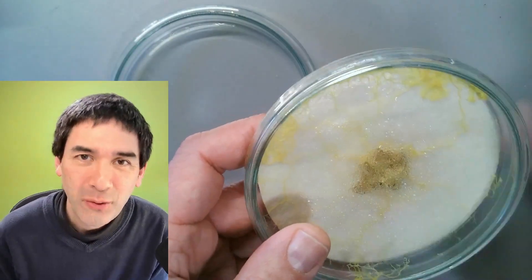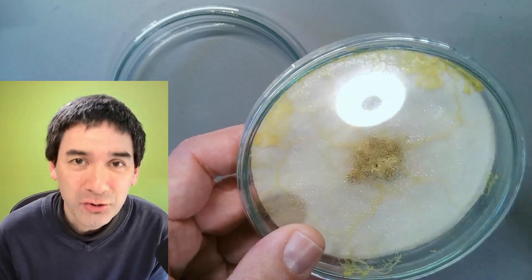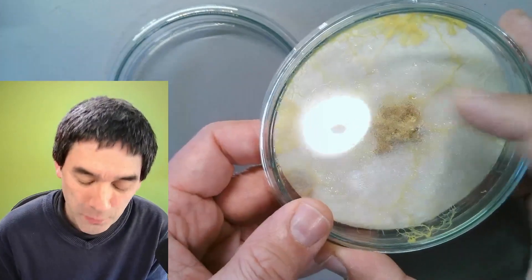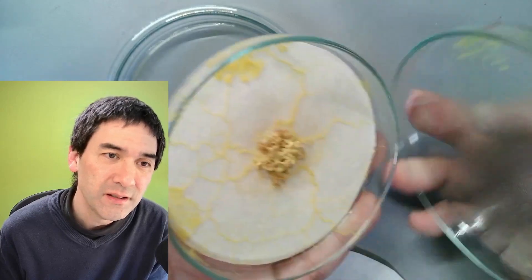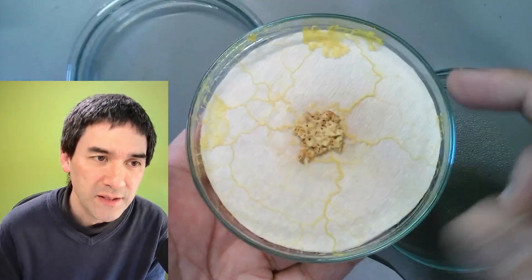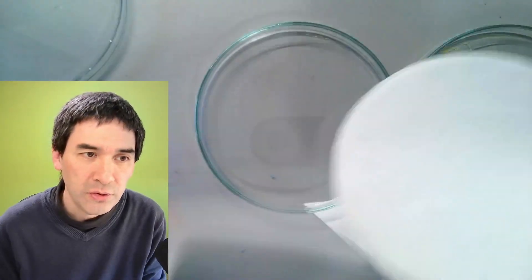If you want to know how I actually started to grow this slime mold, at the end of the video there's going to be a link to the video where I show you how I started this slime mold culture. So what I'm going to do now is carefully open the lid — and we can see it's also on the surface of the lid. I'm going to use some filter paper and transfer the slime mold into a new petri dish.